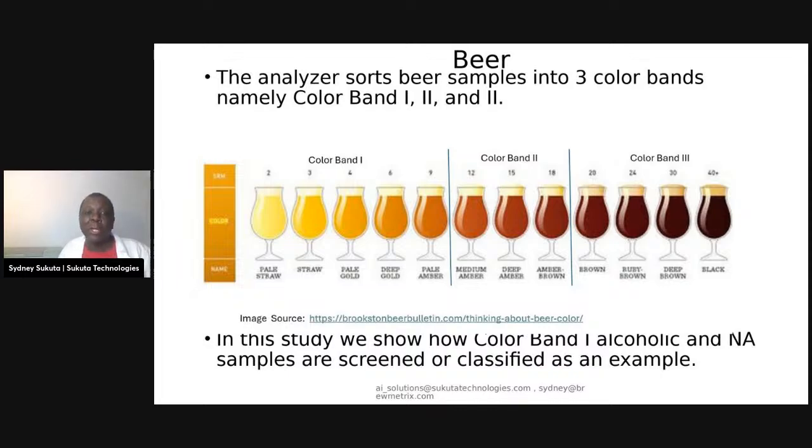For the reasons I told you, we depend on transmission values, as I told you at the beginning. How much percent light went through? Again, if these two extreme beers both have 5% alcohol, the transmissions are going to be very different. This one is going to transmit more, and this one less. And since we use transmission values, the answer is going to be wrong. So by doing this, we find that the answer is no problem. So the first thing we do is categorize or classify our beers by color, unlike water. That's the first thing we do.